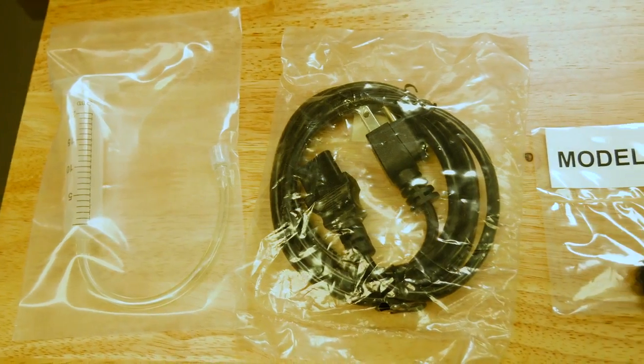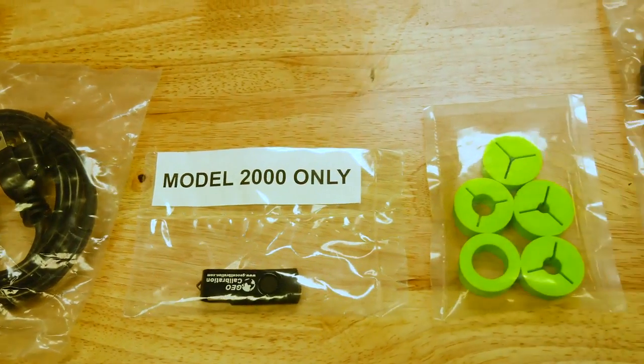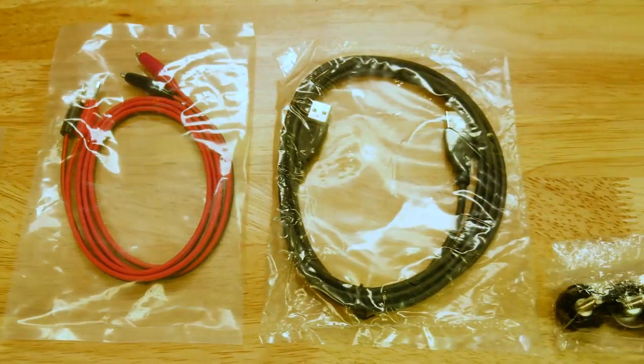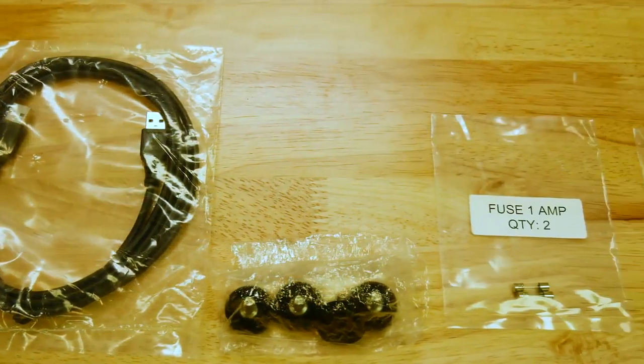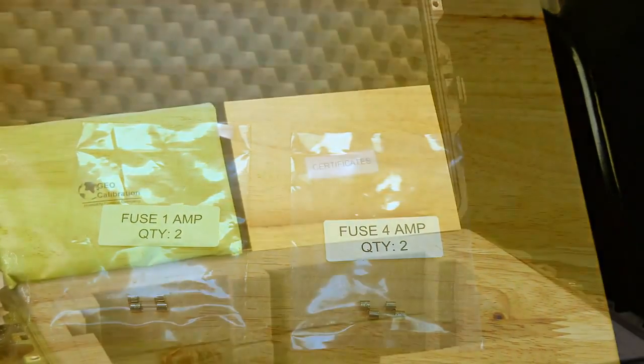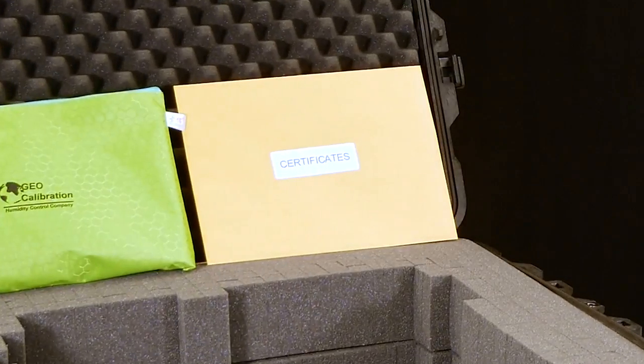One fill tube, one power cord, one USB stick, one five bung set, one set of positive and ground leads, one USB A to A cable, four door screws, two one amp fuses, and two four amp fuses. Finally, you should also have a manila envelope that contains your factory calibration report.